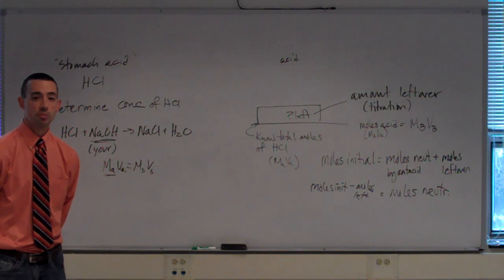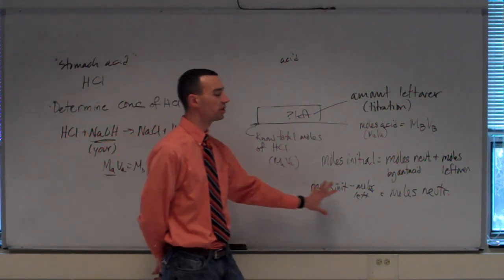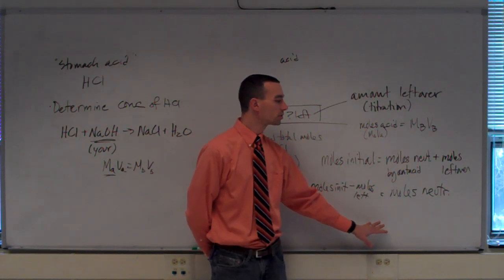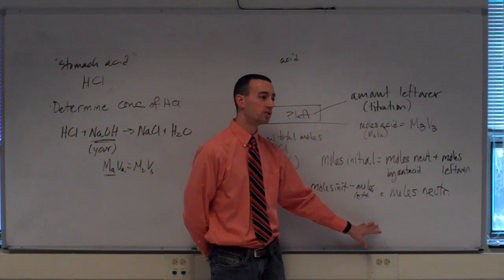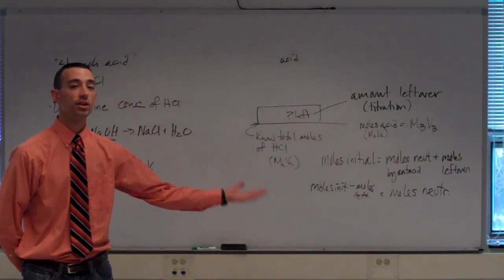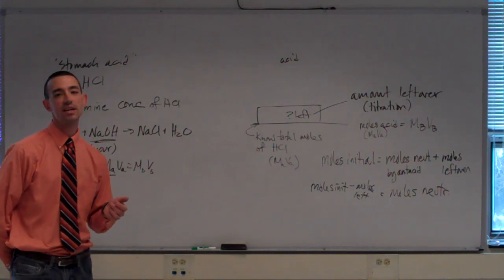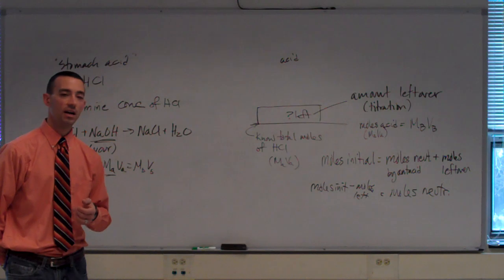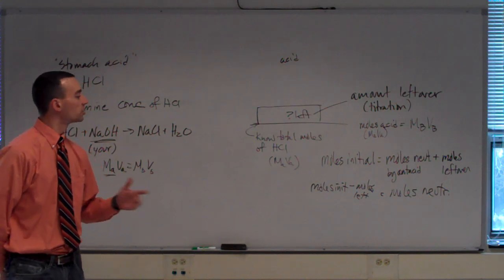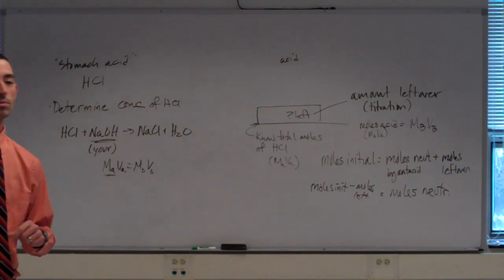When you're done with your experimental work, you will need to complete a portion of your calculations to determine at least your experimental moles neutralized per dose, so that you can share that information with the rest of the class, and get the rest of the class's data, hopefully, before you even leave the lab, so that you can get a head start on writing your lab report. Okay? So good luck with your acid-base titrations and finding out which antacid is the most effective.